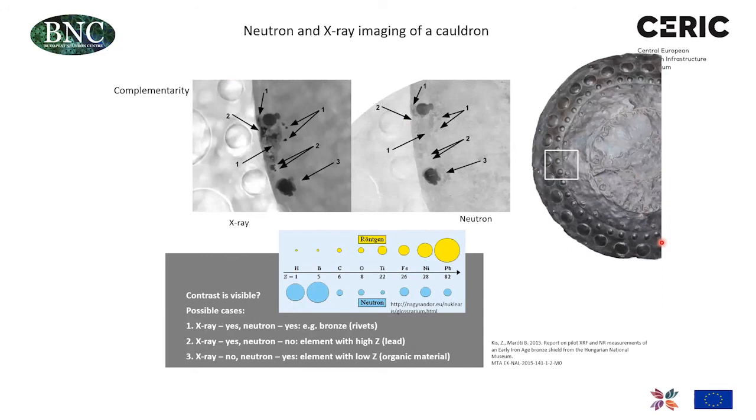We can also get hints from imaging about the positions where we need to study. This was a large shield, about 60, 70 centimeters large. And of course, it is unproductive to scan it entirely by prompt gamma activation analysis.